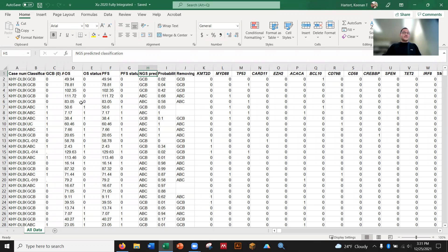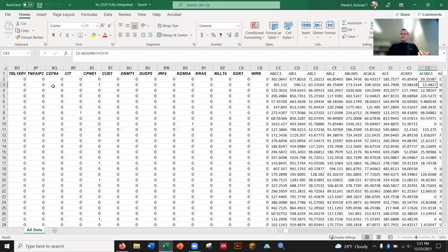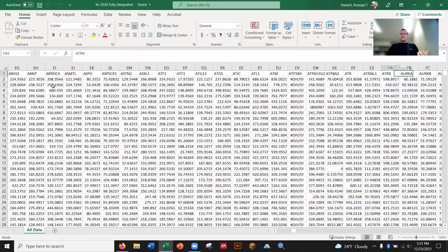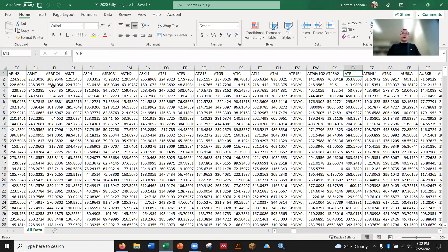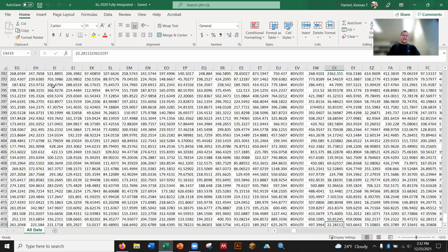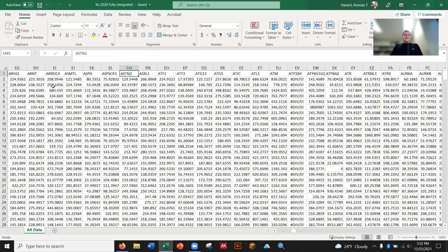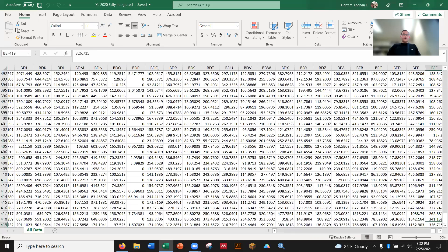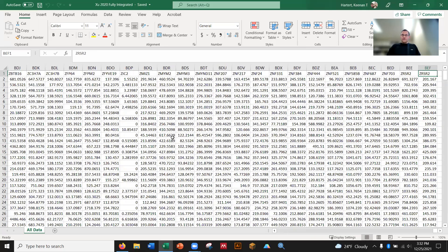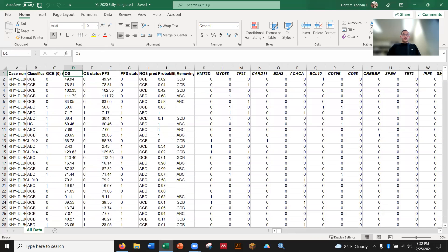I know you can't see my keyboard, I'm not that fancy, but when you are dealing with something this big, so I have about 1,400 sets of genes right here, and these are all RNA values down here. Remember, RNA can go up and down, right? And that's how we can track what's high, what's low in a specific patient's cancer. Now navigating this thing can be pretty big. It's not good to just scroll around. So one way to quicken things up, if you hold control and then one of the arrows, you can just fly up and down all you want. It's really good.